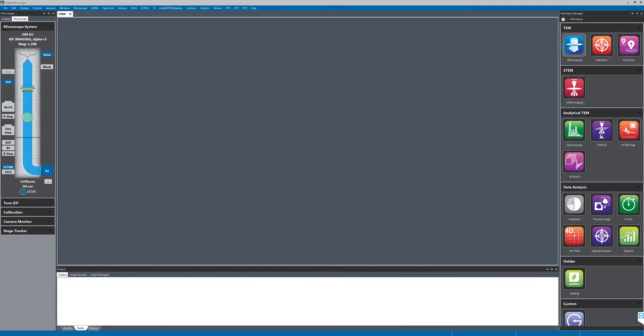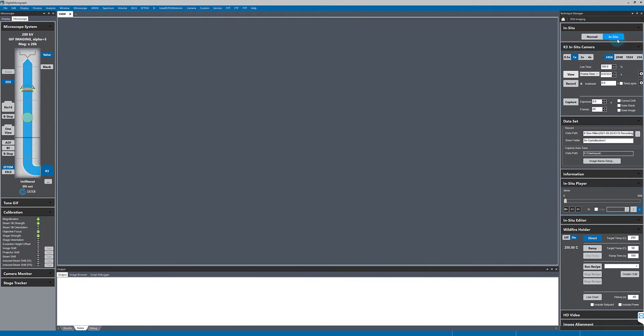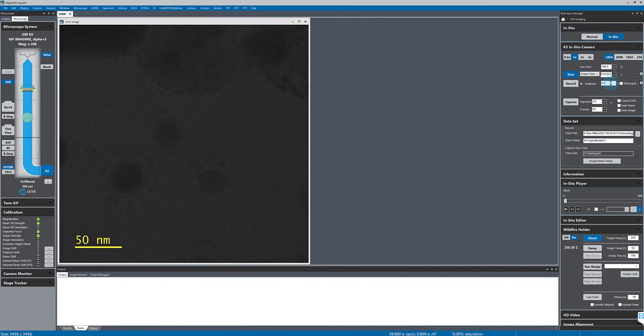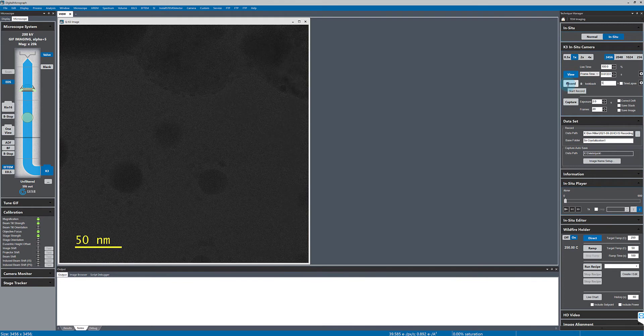In this video, I'm going to record an in-situ data set while controlling a DenSolutions wildfire heating holder within GMS. I'll begin by starting a live view with the K3IS camera.